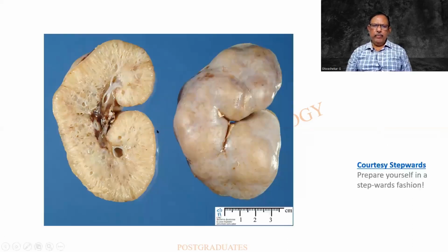So again, a beautiful one. I'm finding radial cystic structures, hardly, they seem to be coming out of the kidney. The external surface is almost normal, but for some bosselated appearance.